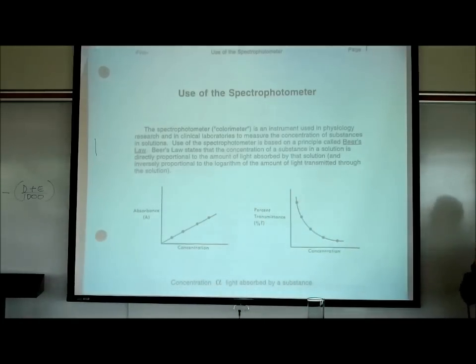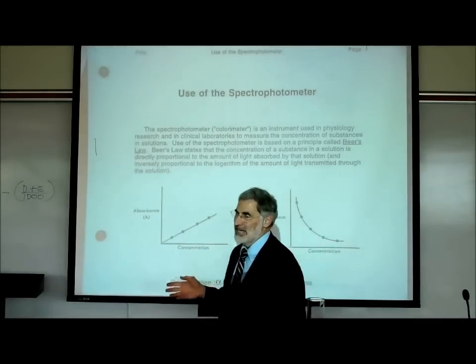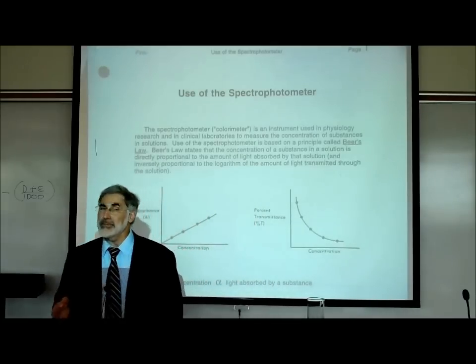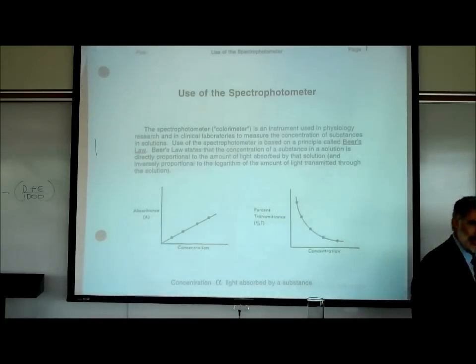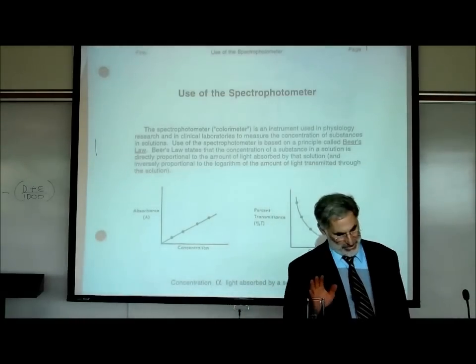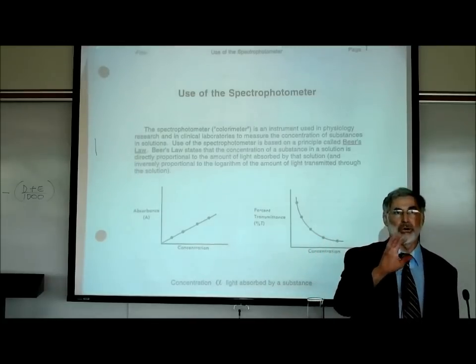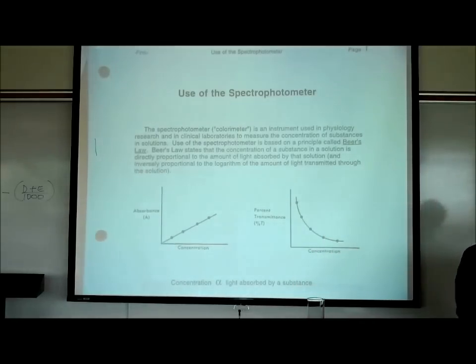Spectrophotometry. My guess is most of you have used a spectrophotometer already. They are used in most chemistry courses. They are used in most microbiology courses. So my guess is most of you are pretty familiar with this. We're not going to do a wet lab today. I'm only going to briefly go over the theory behind the spectrophotometer.